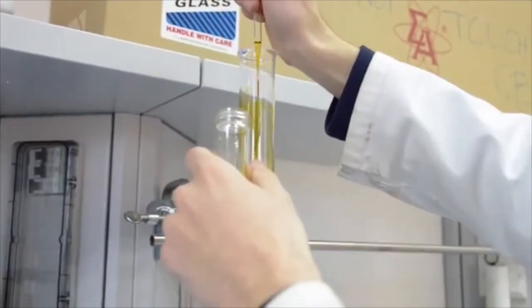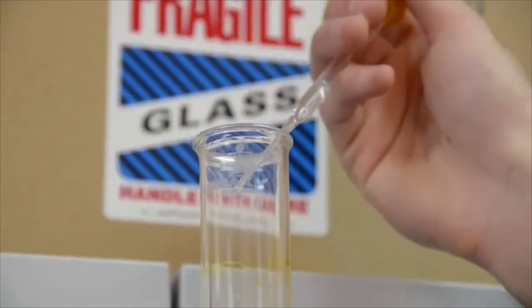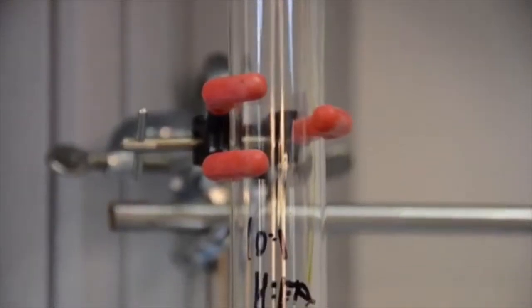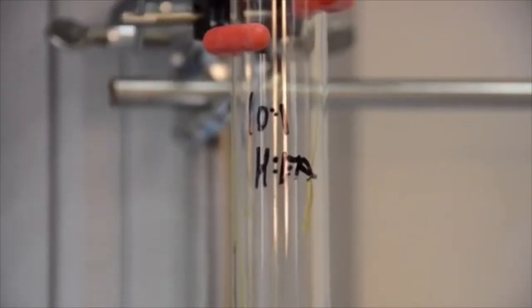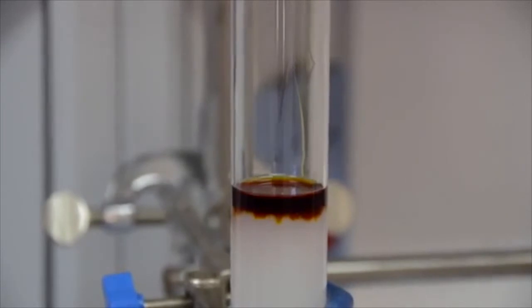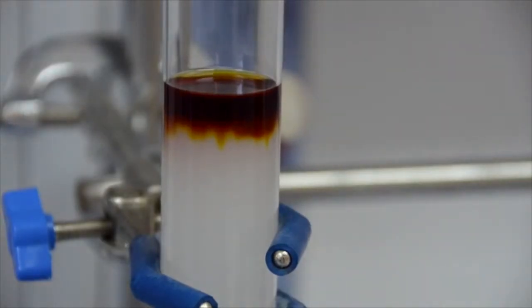Keep a small amount of your sample as a crude reference at this point. Once all your sample has been added, pipette a minute amount of eluent to ensure all your sample has reached the surface. Run down just a small amount of the solvent through the column by opening the tap.